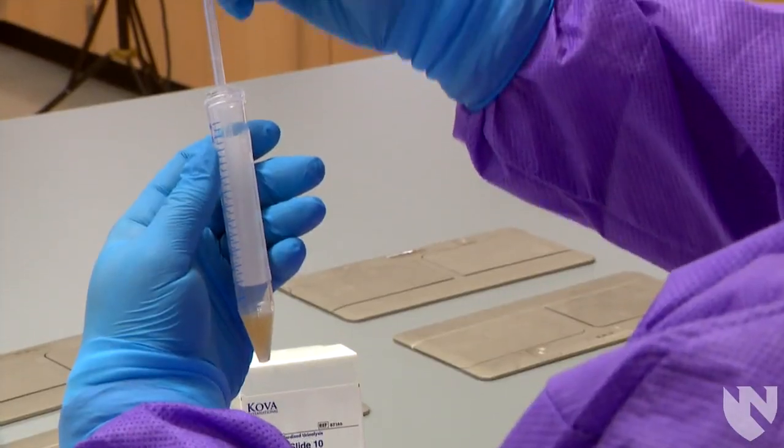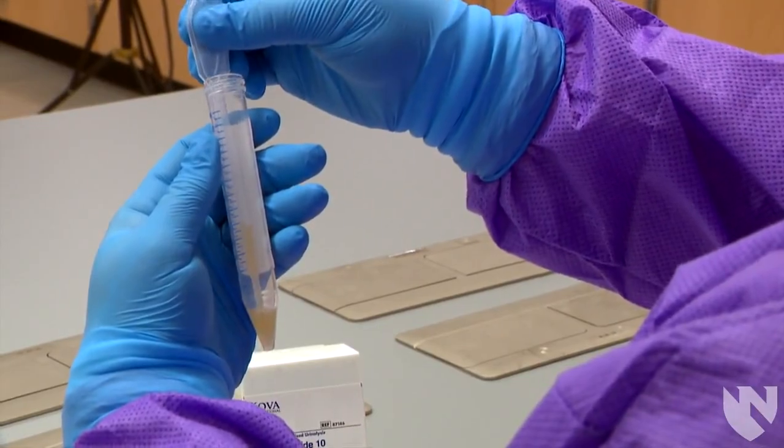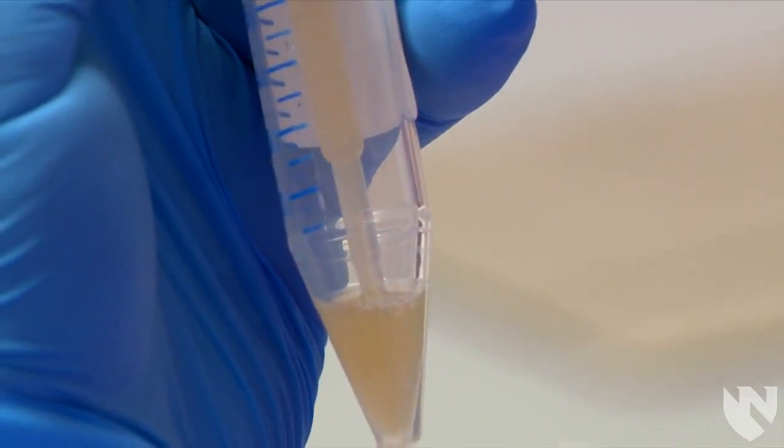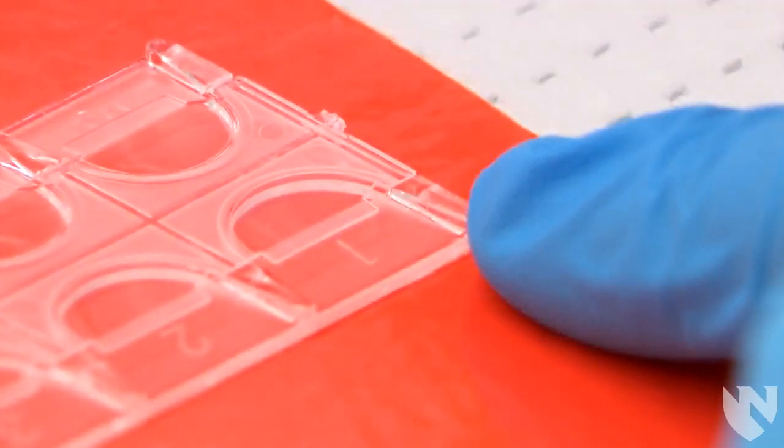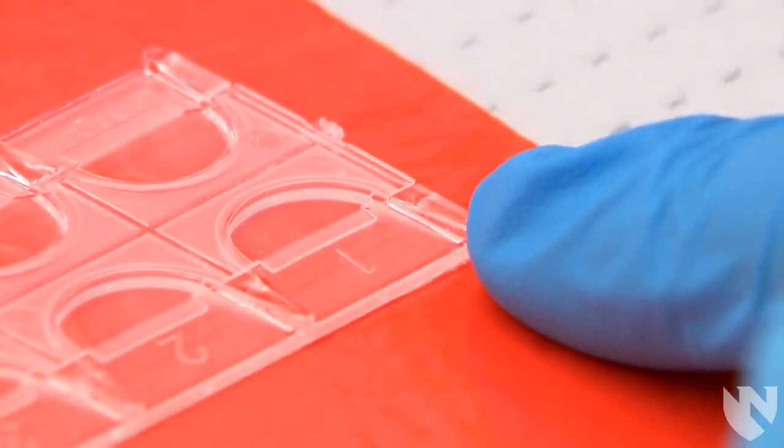Take the disposable pipette and aspirate some of the resuspended urine. Try not to get any bubbles in the pipette. Each well in the Cova slide has a notch. This is where you will place the end of your disposable pipette.